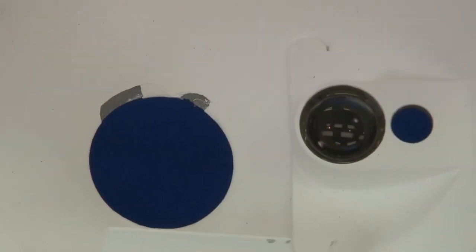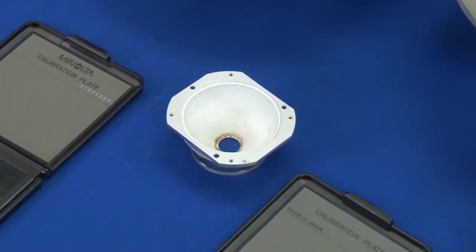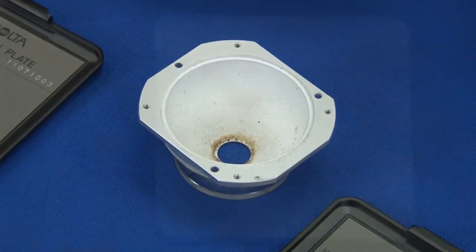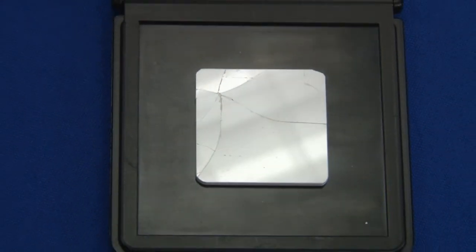Certain conditions could affect the readings depending on your environment. Dirt or dust in the optics or sphere, stains or scratches on your white calibration tile are just a few examples of conditions that can affect the readings.